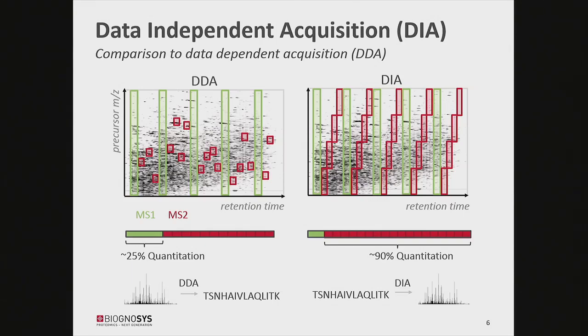And then this is a small technicality, but it's also the title of this course, so it's targeted analysis. Shotgun data is analyzed starting from your raw data. So you start from the spectra and you query your search space. Whereas in DIA, at least if you use a targeted analysis strategy, you start from your search space, your spectral library, for instance, and you query your data with your spectral library. This means that all the algorithms that you are used to processing the data are different, and you can also use different kinds of algorithms, and many of them are quite elegant. So this is an advantage to analyze your data in a targeted manner.